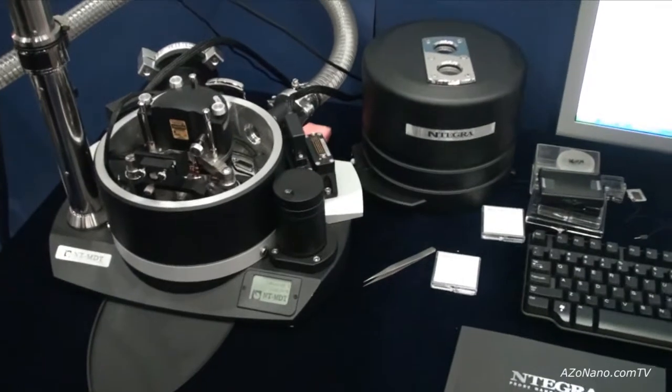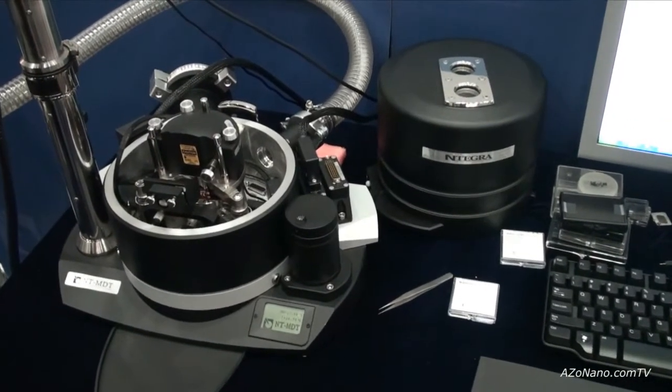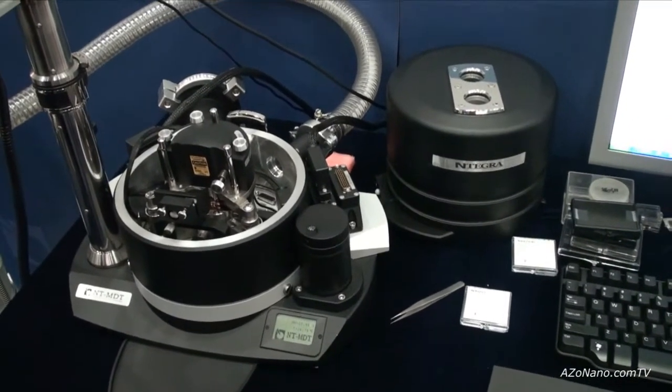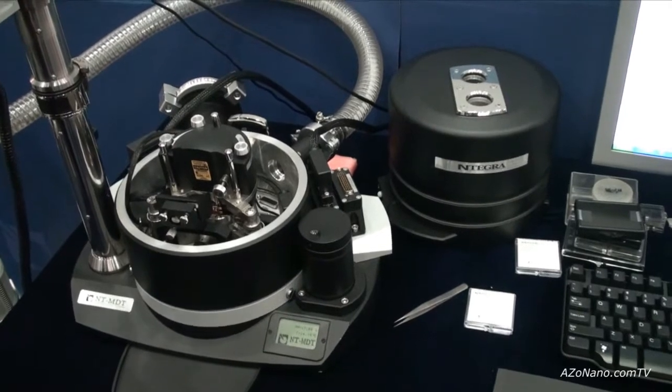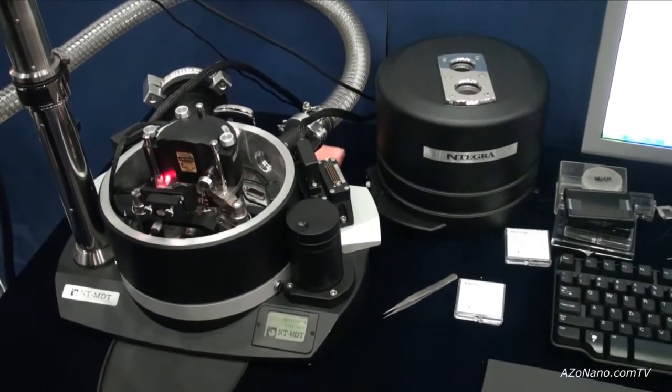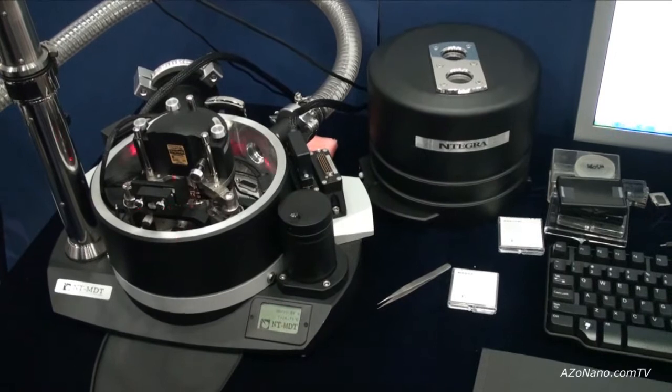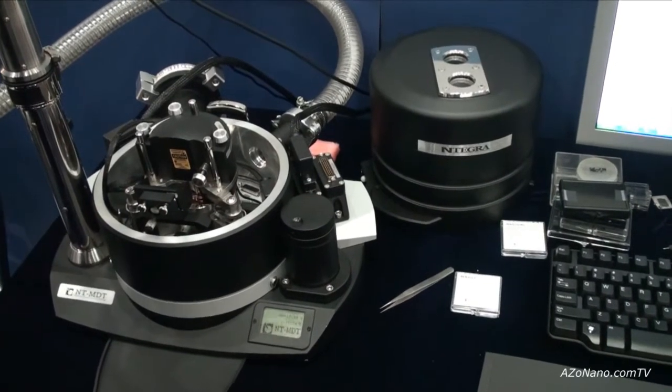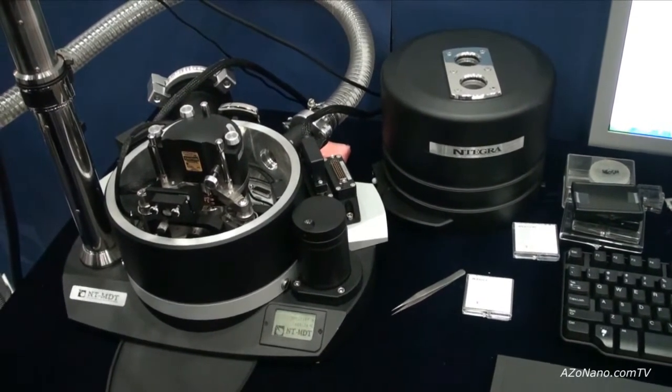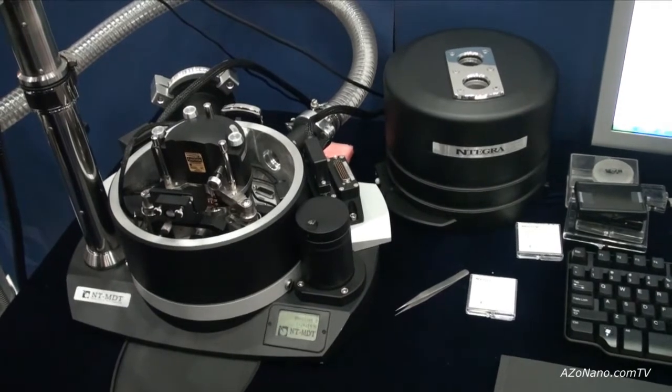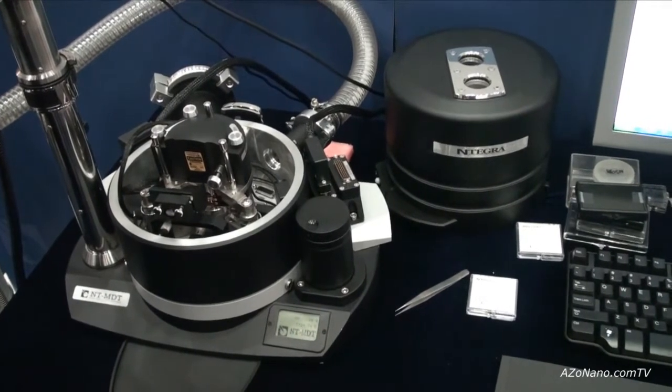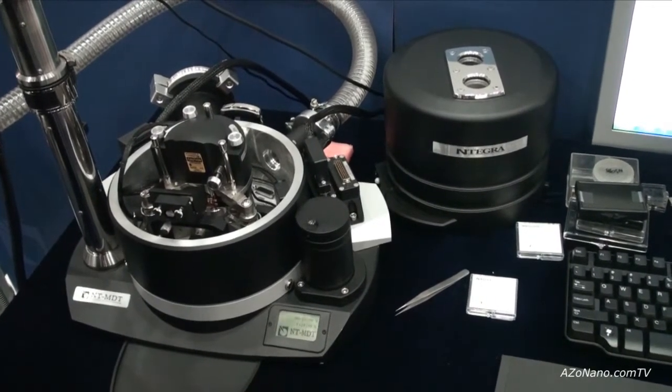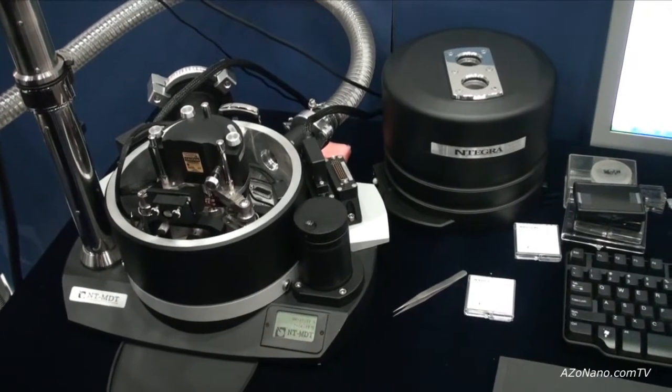In the case of high resolution measurements, you may need another design which we have by changing this triangle to the so-called thermal head. This thermal head allows to get unique low drift with a value less than 10 nm per 1 degree of heat.